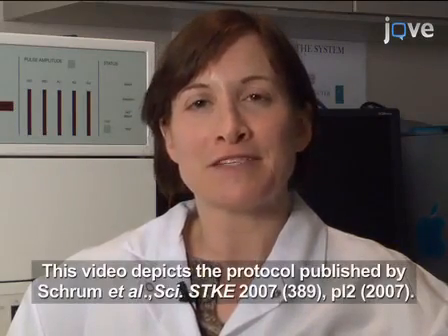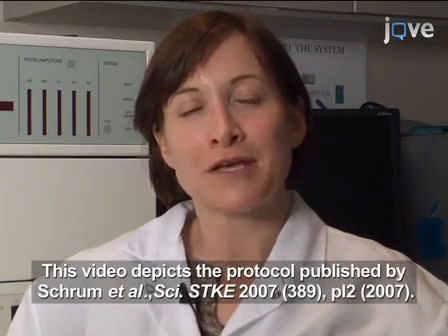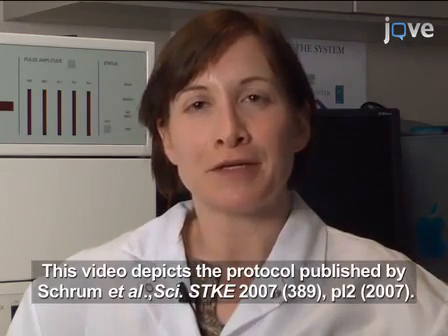The advantages of this technique over other methods, such as immunoprecipitation followed by Western blotting, is the ability of IP-FCM to allow assessment of native protein-protein interactions without requiring genetic engineering or large sample sizes. IP-FCM can yield a high signal-to-noise ratio even when very little biomaterial is available for analysis, as it can be performed with small volumes and low concentrations of analytes.